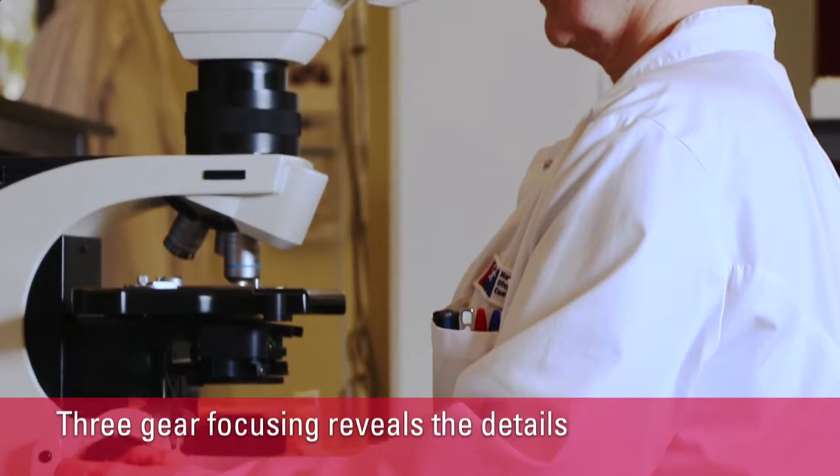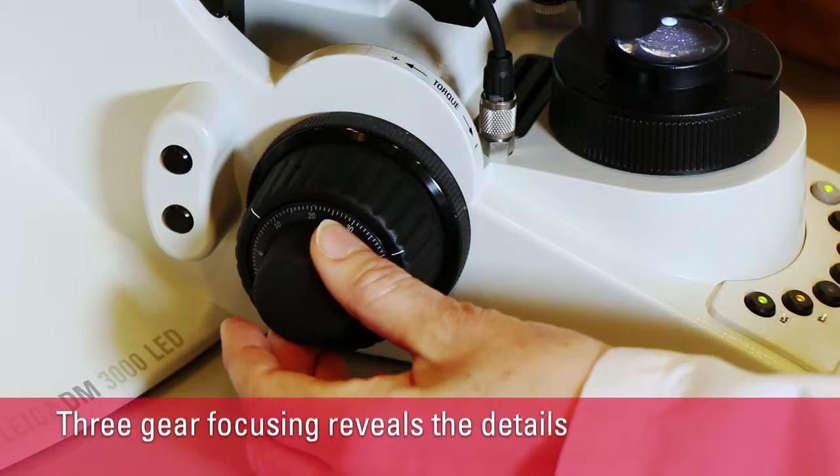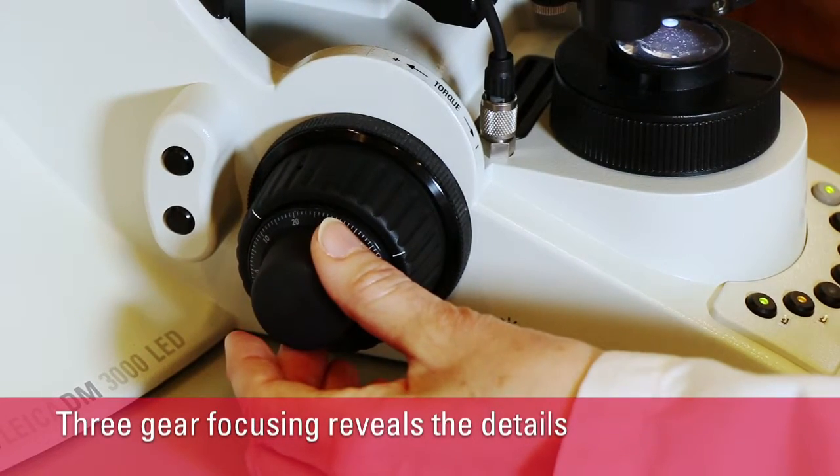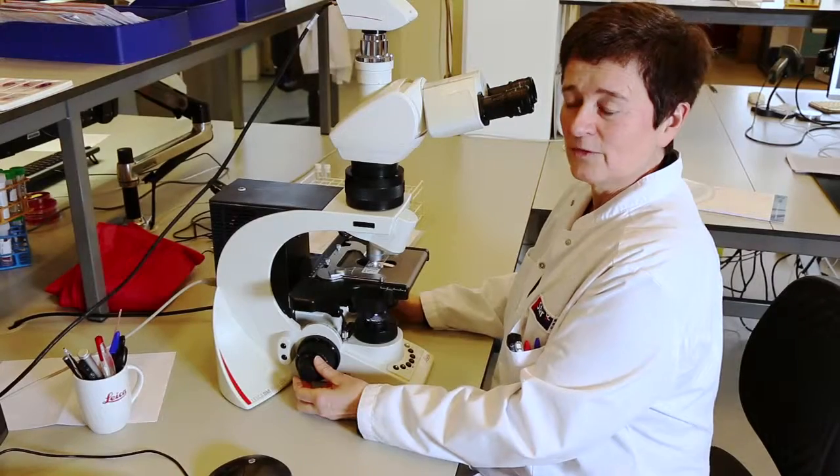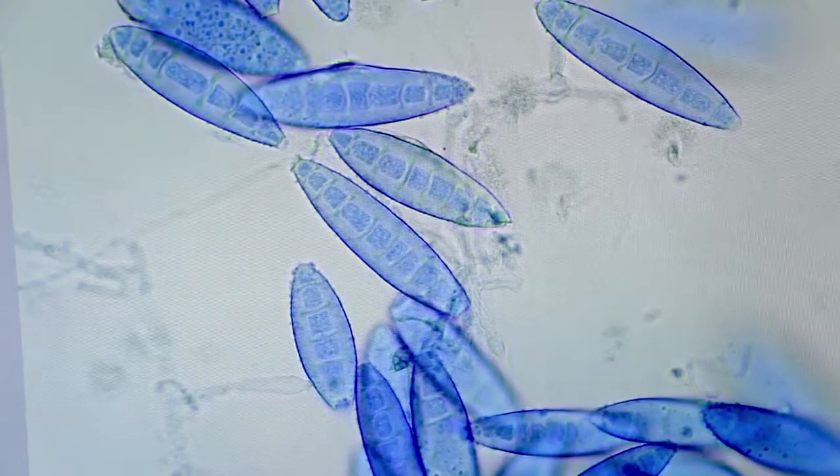This microscope also has a super fine focus. You sharpen the picture with the fine focus, then you pull it out and you get super fine focus. It's very useful for making photographs of the things you have under the microscope.